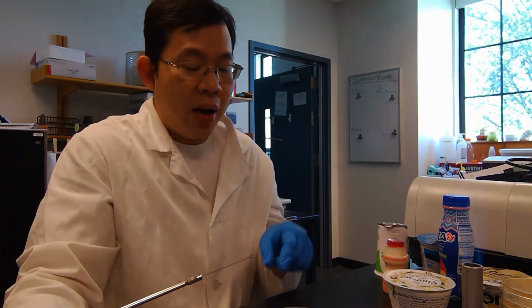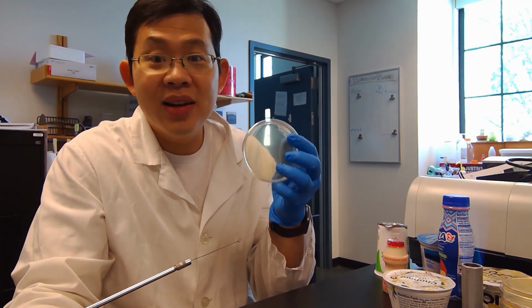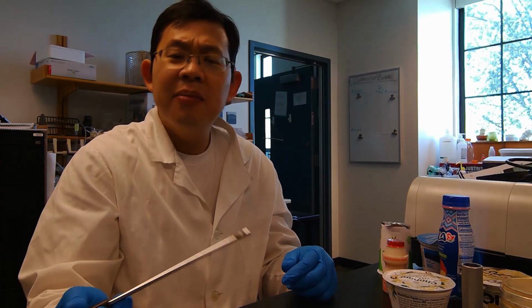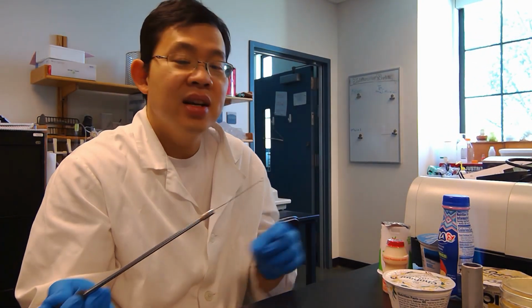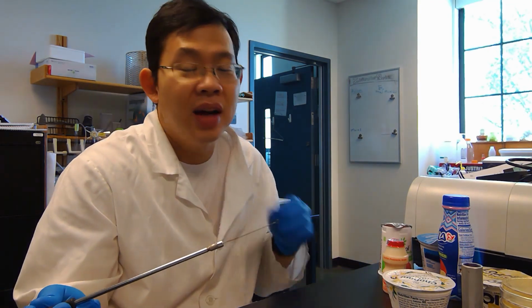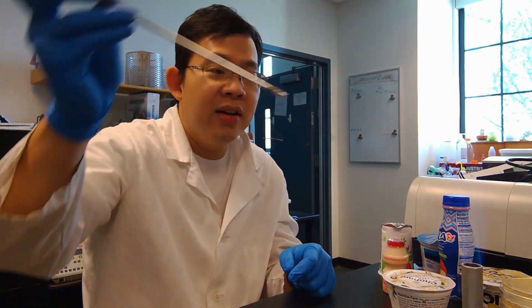Now, in order to do so, we need to spread the sample from quadrant 1 to quadrant 2. To make the second quadrant, you will need to use a loop again, but you don't want to use the same one that you just used over here, because this loop still has the sample from the same source, and therefore it will have the same cell density. Then you may not get a good isolation. So what you want to do is sterilize the loop again by flaming it.